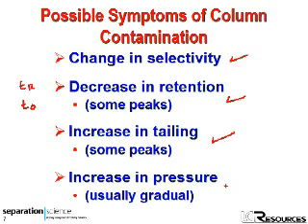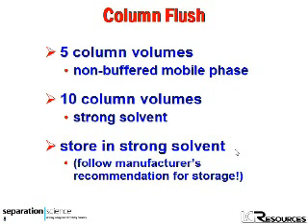And then, of course, last but certainly not least, an increase in pressure, usually gradual over the lifetime of the column, but it can be abrupt, and that can be evidence of contamination, very often things that have precipitated on the column bed.